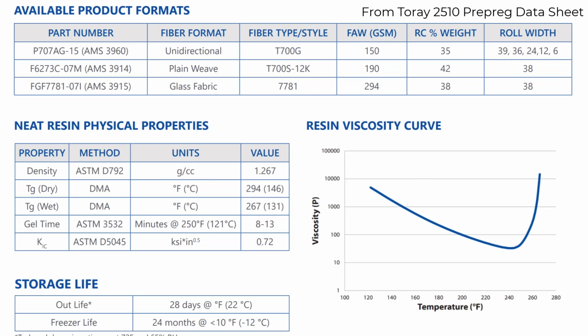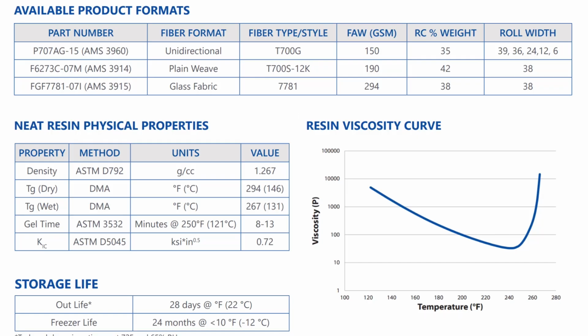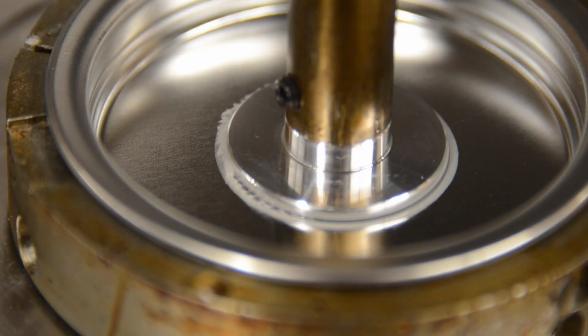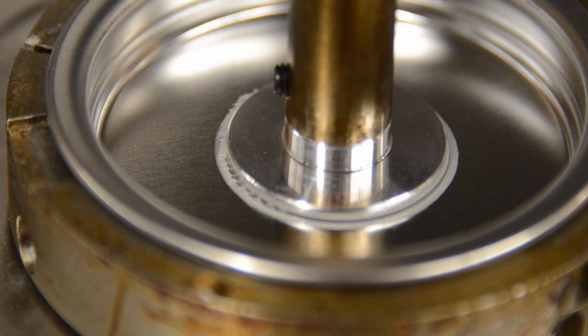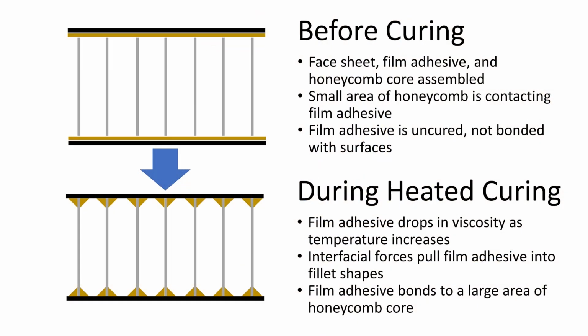The viscosity of the resin as it ramps up to temperature and begins the hold is of interest when designing processes and selecting materials for an application, as well as troubleshooting defects. Now, we will use the rheometer to measure the viscosity of a sample of epoxy film adhesive which is cured with a heated cure cycle. To adhere two components together, it is usually necessary for the adhesive film to reduce in viscosity and flow between the two surfaces to ensure that a good bond is produced.